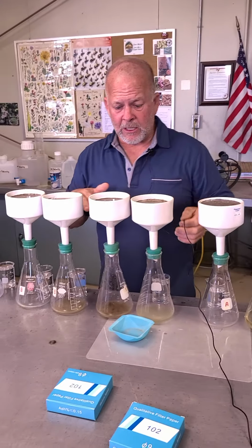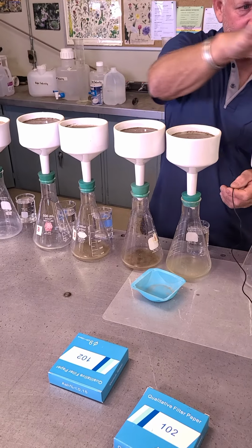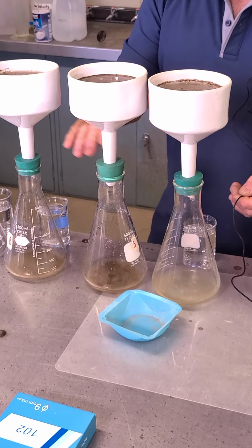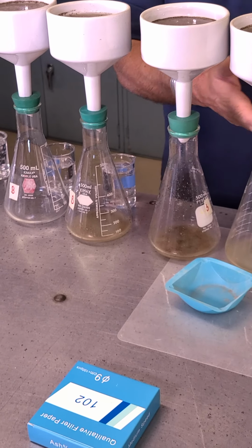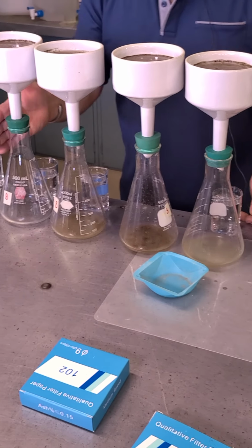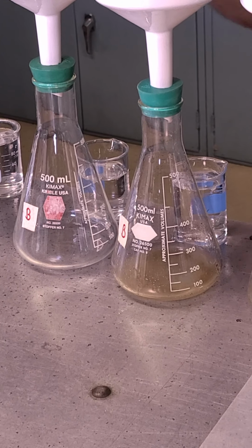We'll just zoom in on the camera. This is the loamy sand here in the middle. There's the loamy sand. This was the loam. You can see, again, kind of an interesting treatment. You've got 1, 2, and 3 here. Even the colors are a little bit different. Number 4 again, this is number 4 here. I don't really see anything dripping through.